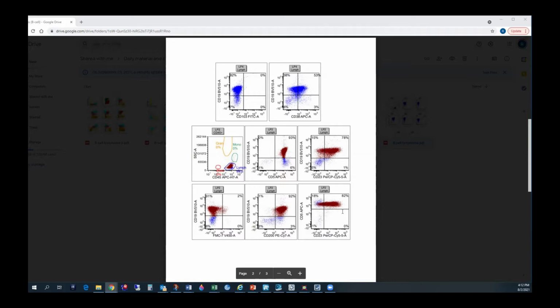When it is positive in a CD5 positive, light chain restricted population, then we favor CLL. And also, I think it is very strongly positive in hairy cell leukemia, right? CD200, yes. I think it is positive in all the low-grade B-cell lymphomas.